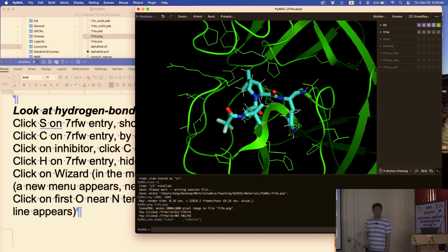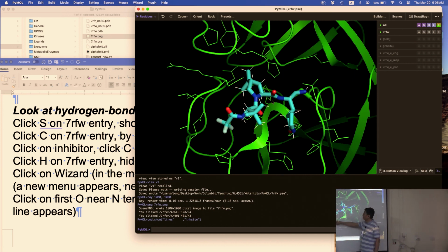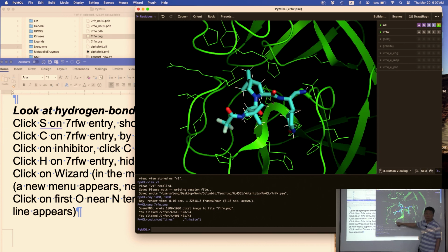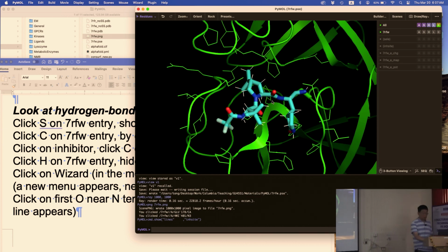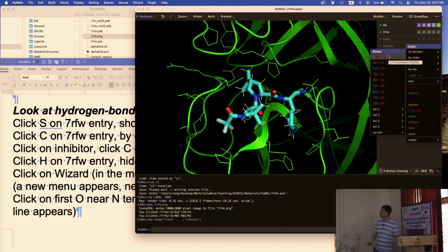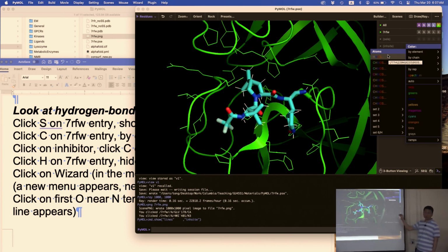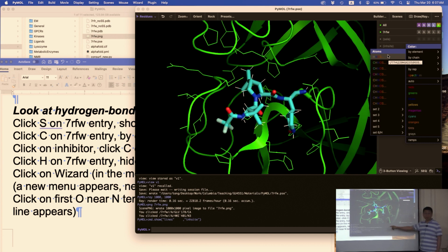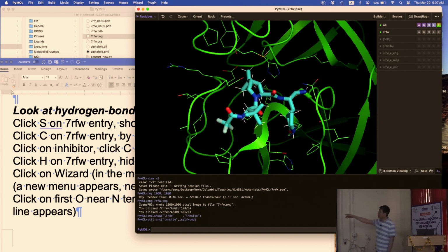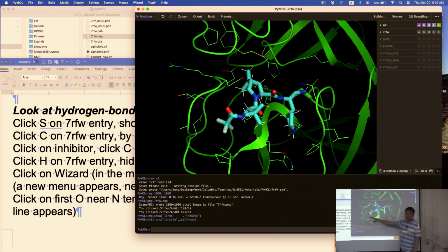But then you see a problem now because we colored everything green earlier, so the arginine's all green now. So you want that to have some kind of nitrogen, oxygen colors. So you want to change the color of the nitrogen and the oxygen, but you don't want to change the color of the carbon. So you can do that. Go to that inhibitor site, color by element, select the first one. The first one is changing colors of the nitrogen, oxygen, and the sulfur. Doesn't touch the carbon. Leave the carbon where it was. Okay? So if you do that, you can see now you have everything colored correctly. So that helps you to tell which residue it is. Okay?